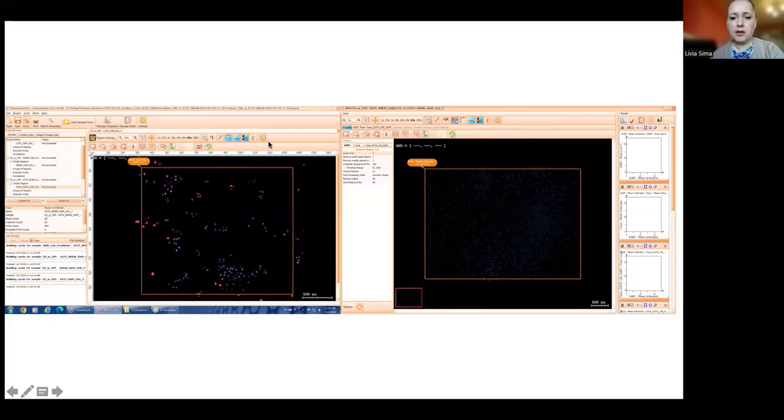Here is a print screen of the two screens of your TissueFAXS workstation, where you can see in the left part the menu related to the list of samples in your project, and an image of one of the samples that is selected. On the right side, there is a panel where you can modify every parameter for detecting the signal with high precision and increasing the signal to noise ratio detection in order to have a good image segmentation.